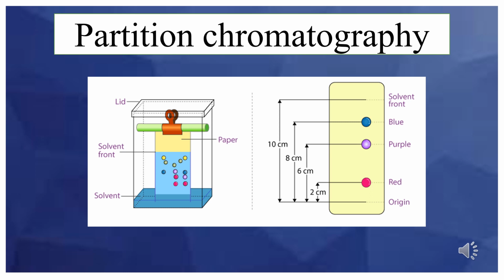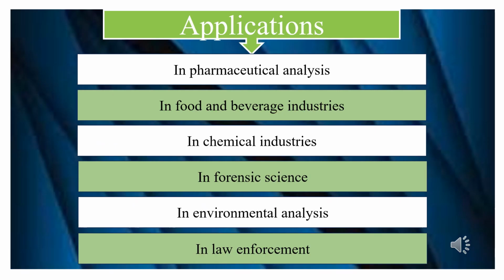In this process, chromatography paper is used as a stationary phase, which is suspended in a mixture of solvents that act as a mobile phase. And here we put a spot at the base of the chromatography paper with the mixture to be separated, and as the solvent rises up this paper, the components are carried to different degrees depending upon their retention on the paper. The components are thus separated at different heights.